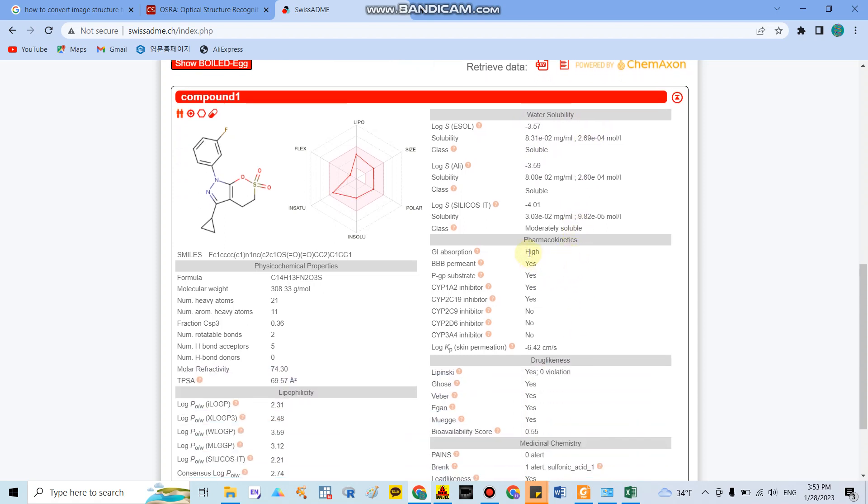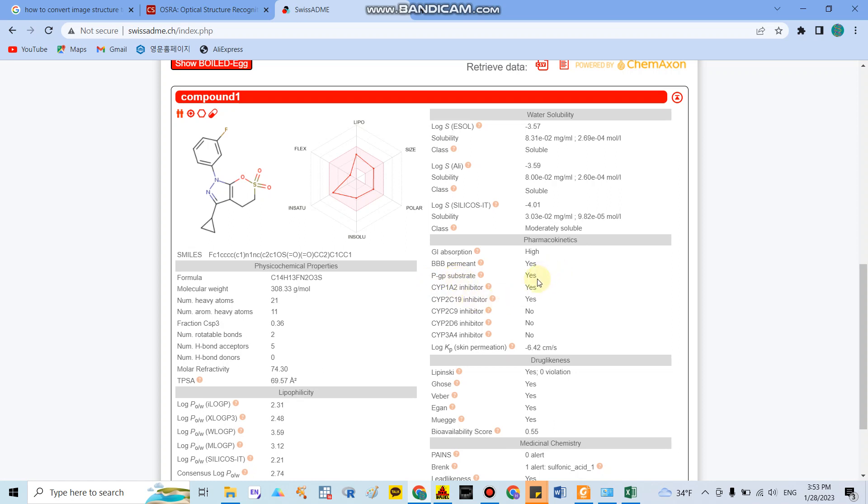Especially here they will show you the compound's pharmacokinetic characteristics. For example, here this compound has high gastrointestinal absorption, they can cross the blood-brain barrier, and this is the P-glycoprotein substrate that when the compound enters the brain, the brain will remove them by transporters.